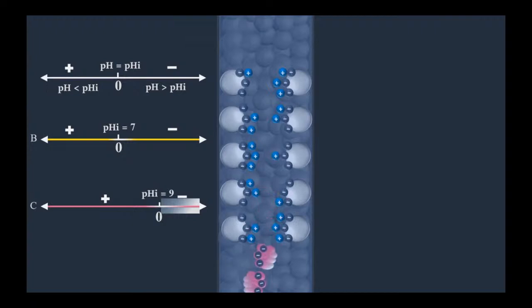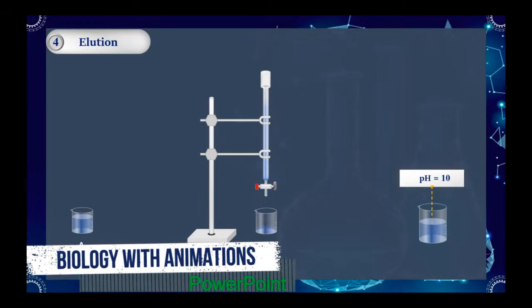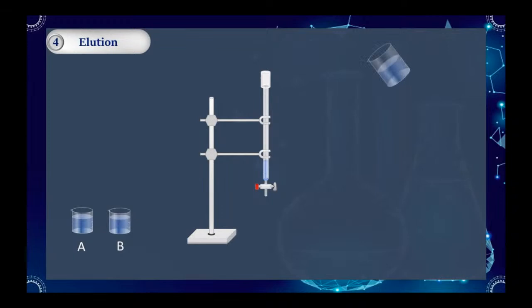One of the primary advantages of ion chromatography is that only one interaction is involved during the separation. Another advantage of ion exchange is the predictability of elution patterns. By controlling changes in ionic strength or in pH of the buffer, using different forms of gradient, proteins are eluted differently in a purified, concentrated form.